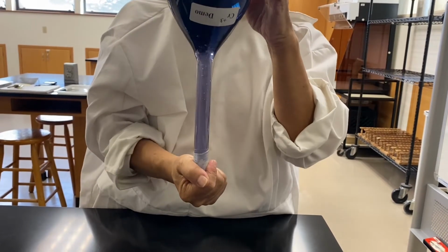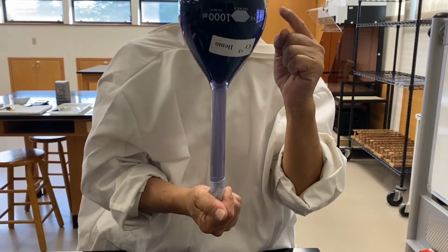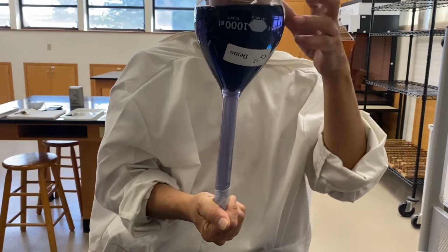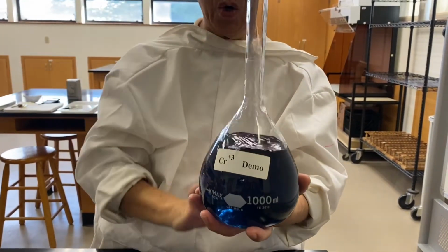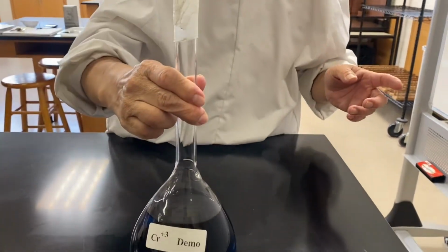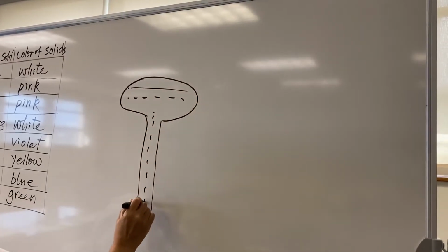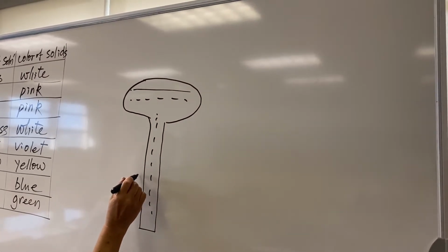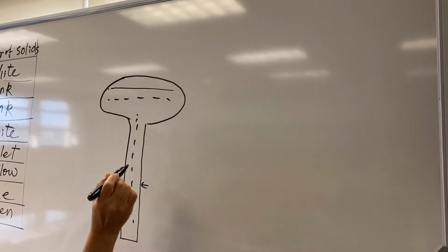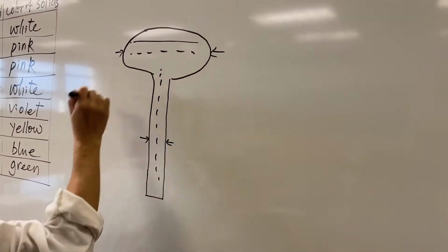Do you all think the concentration right here is higher than the concentration right here? Obviously not, because it's all uniformly distributed. So what is the cause of this? All right, so the distance light travels past this distance, all right?